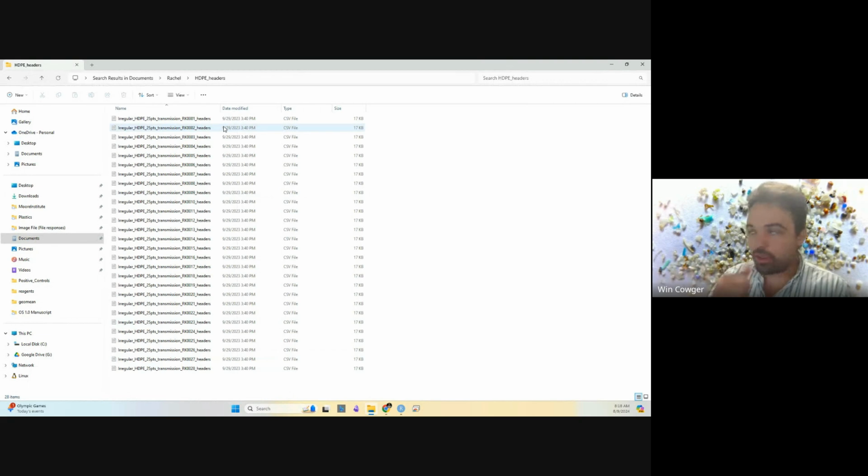Some of the things to think about: one is that it should all be pretty similar spectra, collected in the same way. All of these spectra are transmission FTIR spectra that were collected with the same settings. If you're using Raman and IR and a bunch of different settings, and your spectra are all over the place, it's going to be pretty unwieldy to do batch analysis on it, because in batch analysis, we're not fine-tuning the process one spectrum at a time.